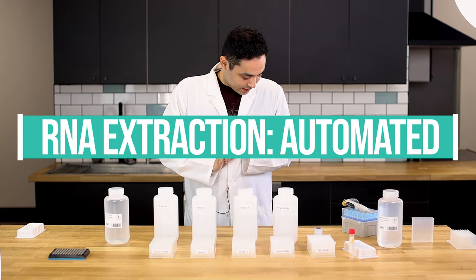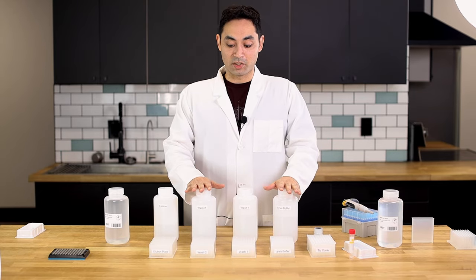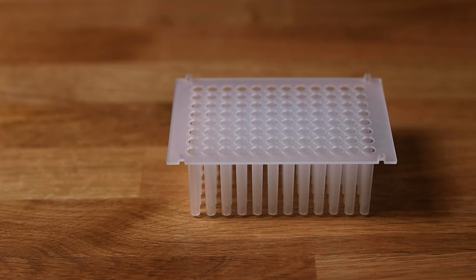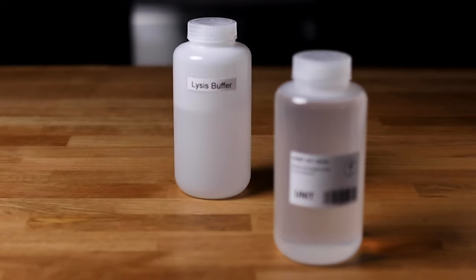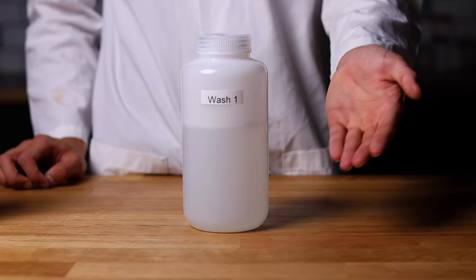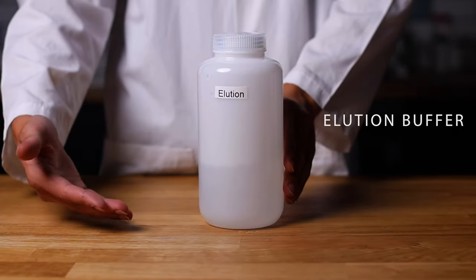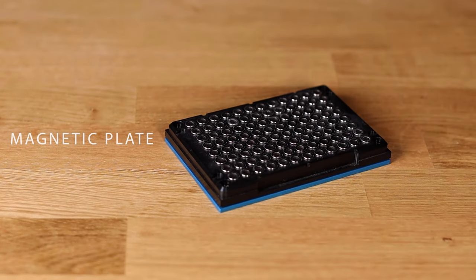The first step is to prep the plates for RNA extraction — you've got to load all these solvents into the well plates. For materials you're gonna need: sample tubes containing your samples, tip combs, 96-well plates, proteinase K, magnetic beads, a reagent reservoir, lysis buffer, Wash 1 which is an isopropanol-based wash, Wash 2 which is an ethanol-based wash, elution buffer which is water, pipettes and pipette tips, and if you're doing things manually you'll also need a mag plate.